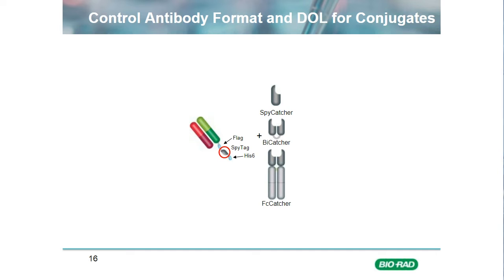So, for example, affinity measurement usually requires a monovalent antibody format to get a nice clean affinity measurement, whereas bivalent formats have a higher overall avidity or functional binding strength. Detection antibodies are usually labeled, and serology controls such as anti-drug antibody positive controls should ideally resemble the native antibodies which will be the analyte in the final assay.